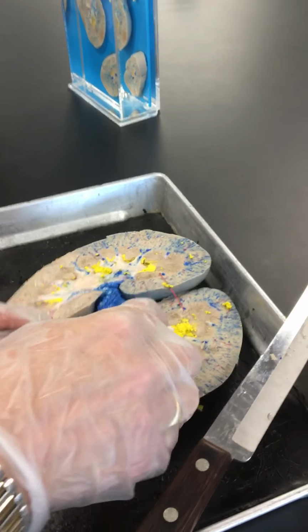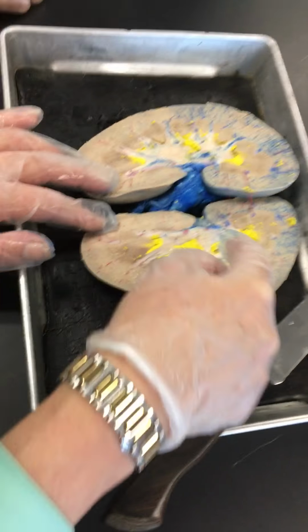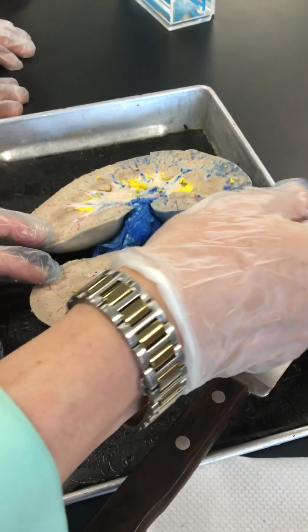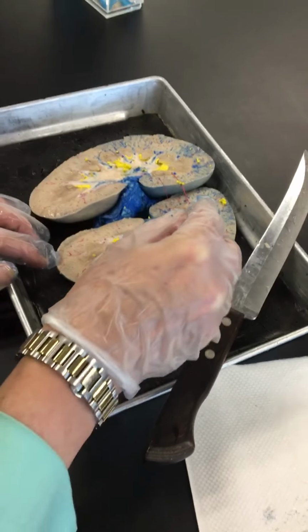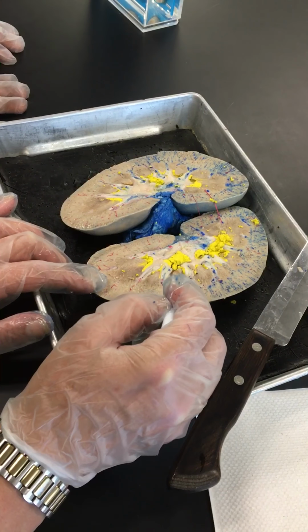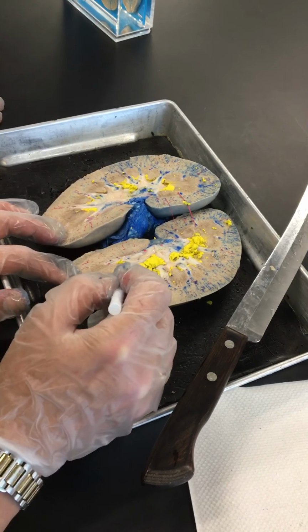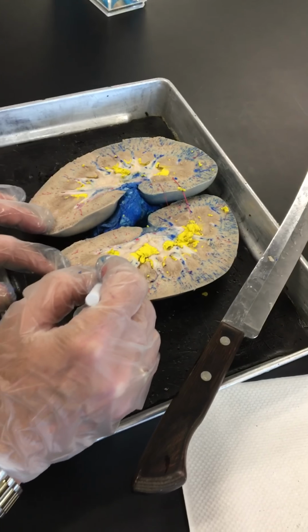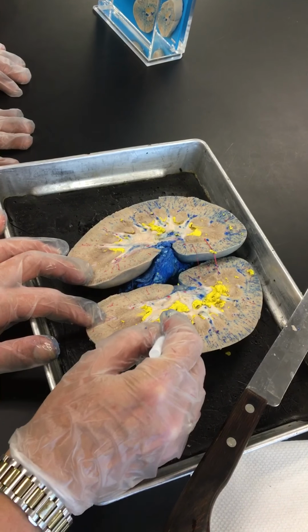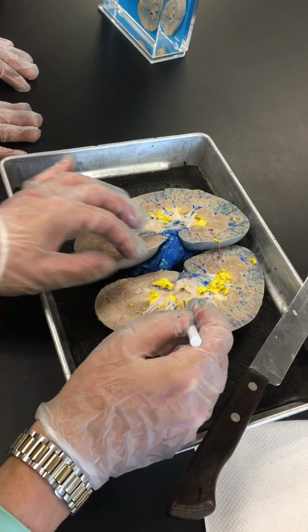So once we open it up, again, the hilus is going to be this indentation here where these vessels are entering and exiting. And so the outer region, cortex, inner region, medulla. And this one's nice because it has the yellow representing the urine, so you can really see where those calyces are. So the minor calyces are these small, where it comes up to kind of the horny point, and then the major calyces are these bigger openings here that would fill with urine.